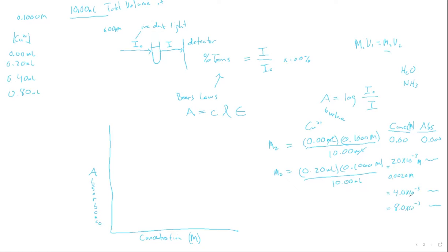So from this, we're going to have our concentration value and our absorbance value, and we're going to plot it. So our first point is 0, 0. So we're going to have a plot right here. And so we're going to have a bunch of numbers.